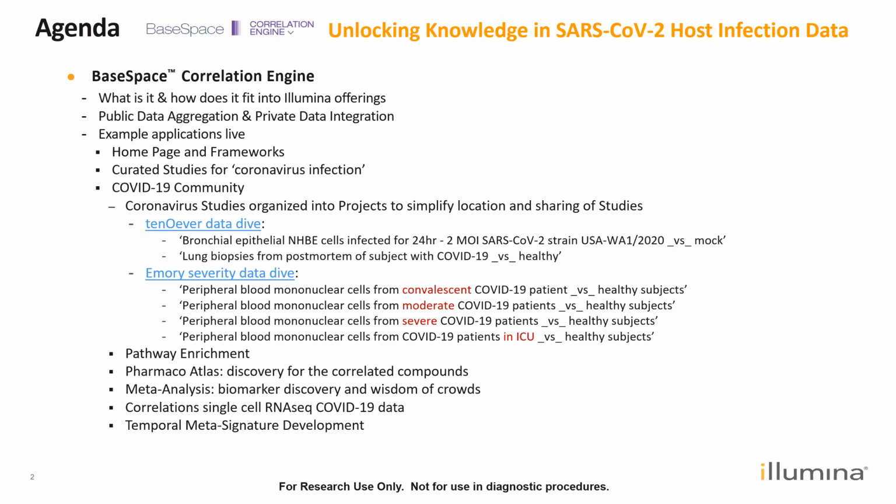I will show how omics-scale data curation and aggregation from public resources can produce novel insights independent of or alongside integration with your own private data.